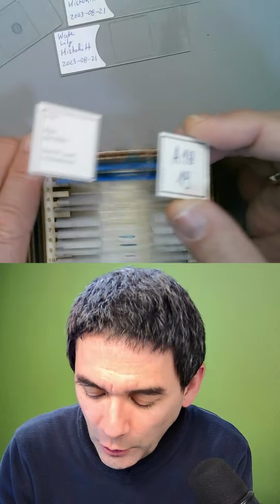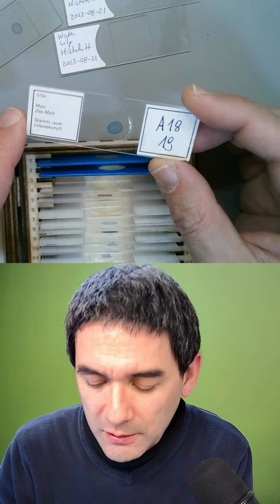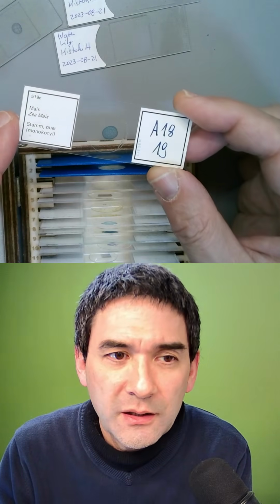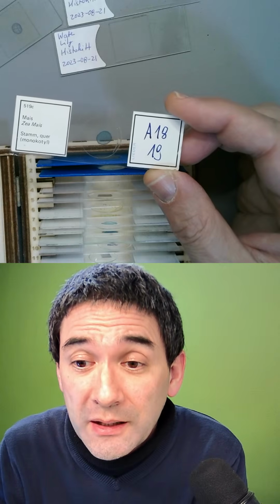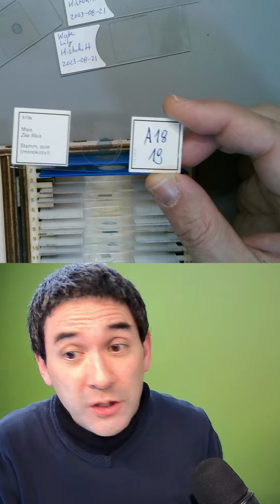And some of them are fairly old, around from the 1980s. They're made by a German company that made those for educational purposes. And the company is also producing slides for medical training. Yeah, histology slides from human tissue.